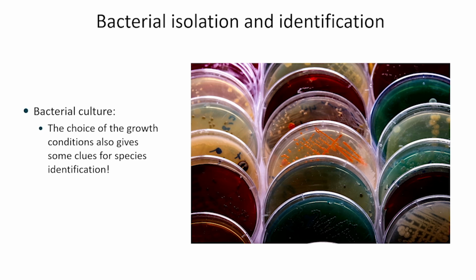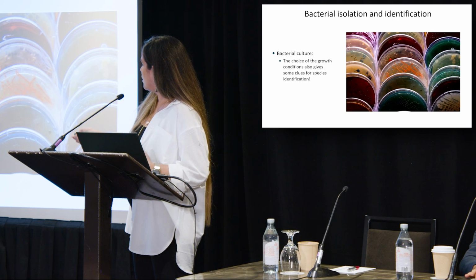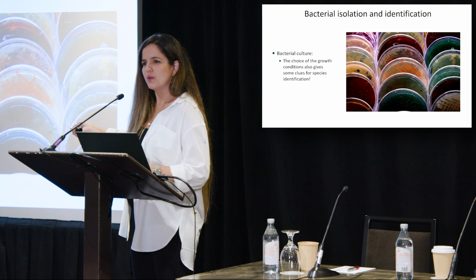Sometimes we wait 18 hours, sometimes 24 hours, sometimes even 48 hours, and for a few microorganisms, up to 7 days, right? And then what we see right after that, if there is a microbe with the potential to grow in this specific medium, you're going to see plates like this one.